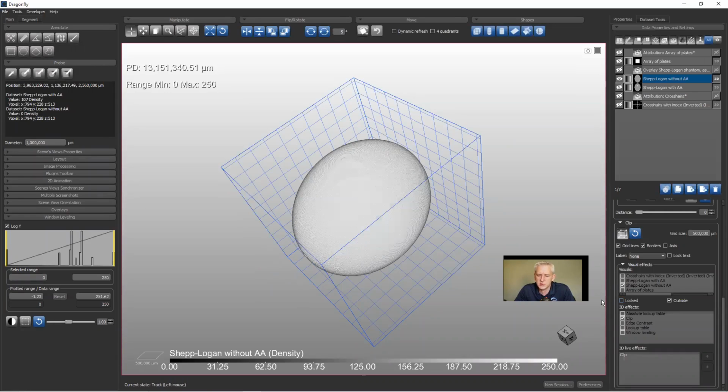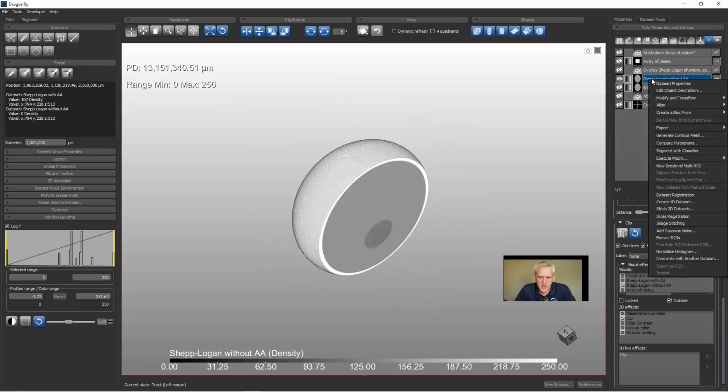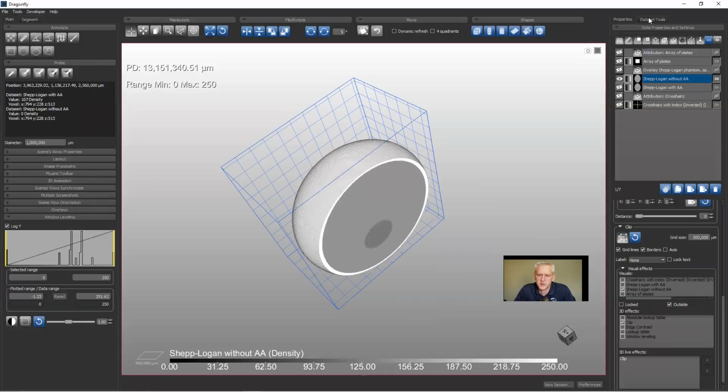So I could turn off the clip box. Let's just say I had left the clip box right here, and then I turned it off. At any point, I can right-click on the image channel, go back to that Modify and Transform submenu, and choose Crop. That's without anti-aliasing. Normally, it turns on the visibility of the clip box. I'll turn it on for myself.